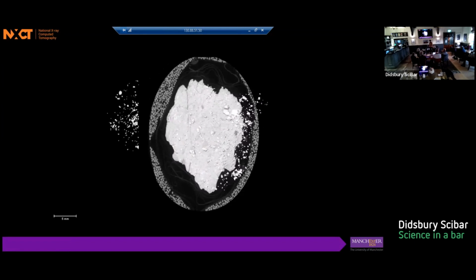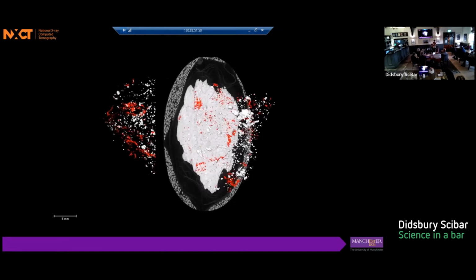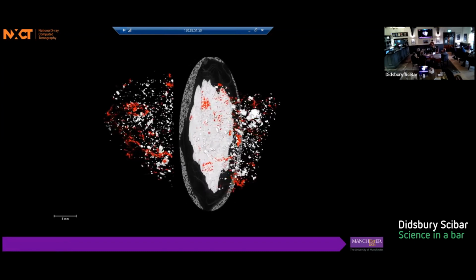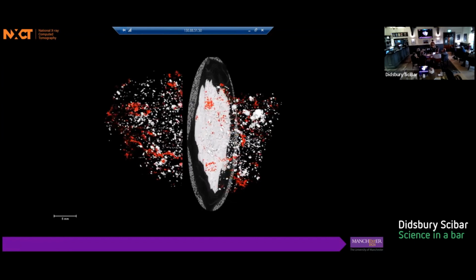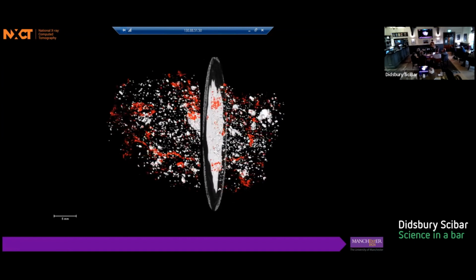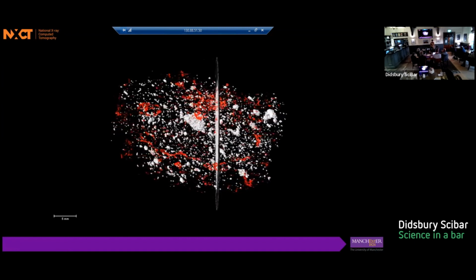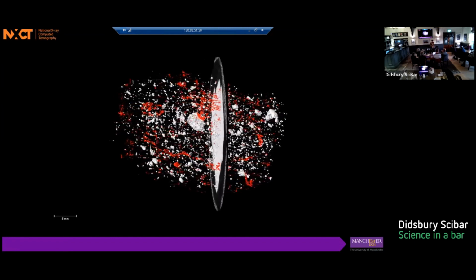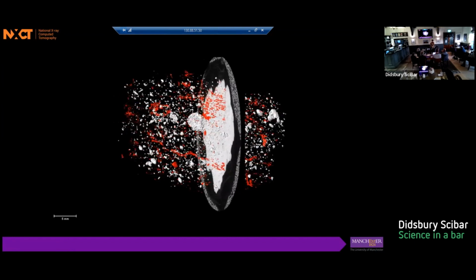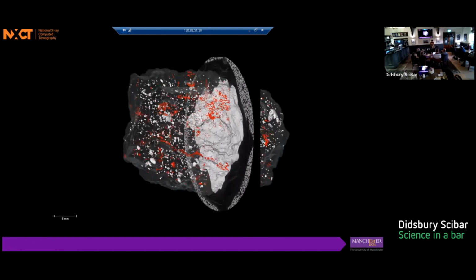As well as a geologist, I've learned how to infer the mineralogy of a rock by looking at its shape, by looking at its density in comparison to its neighbours, and various other things, and also by studying the rock itself and going, oh, there's a mineral on the surface there, it looks like this, I can see it on the CT scan, therefore I can infer that these other ones around the other side of the rock are the same mineral, probably.